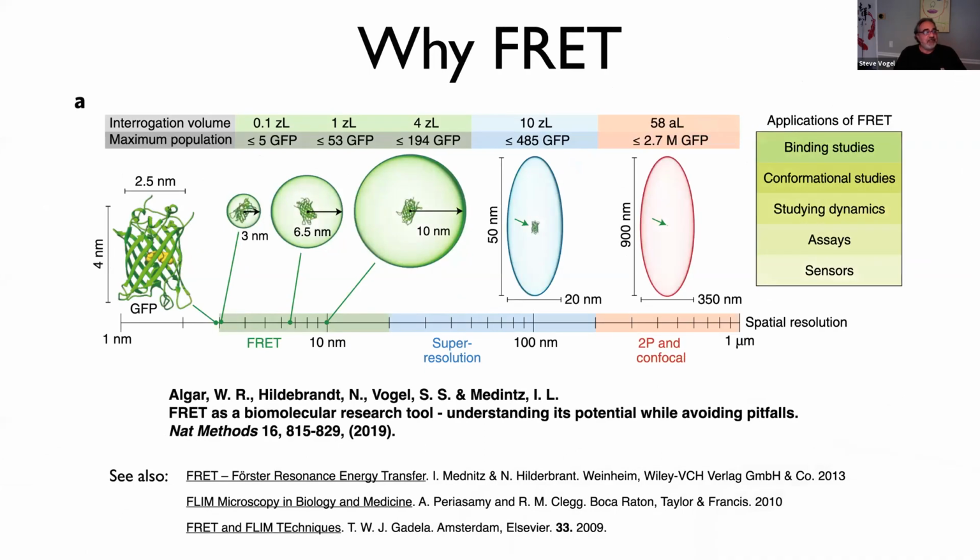Okay, this is a figure from a recent review paper I had, so it's a shameless plug for our review paper, but it's trying to get to the main reasons why we think people use FRET. And it's shown in that green box all the way on the right, applications of FRET. So what is FRET? It stands for Förster's resonance energy transfer.